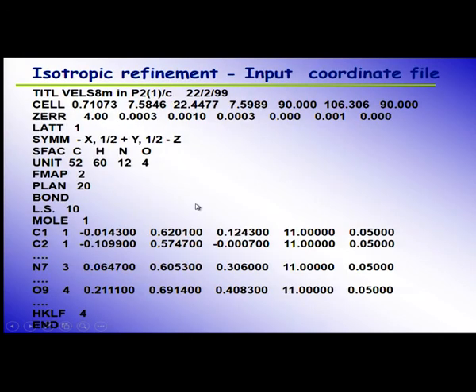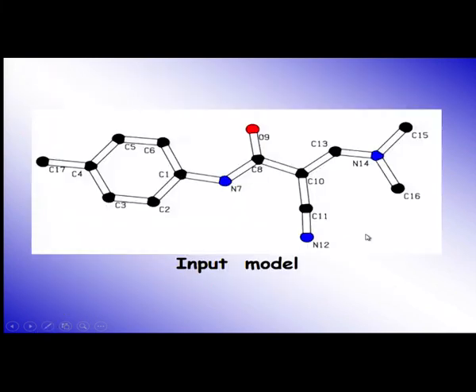Here also if you look, the time taken is only 2 seconds. Such a determination took 1 second CPU, now it has taken 2 seconds CPU. So, this is known as isotropic refinement. And if you look at your RES output file, everything is here. There will be a slight change of the positions from the input given, and this is your starting value 0.05.